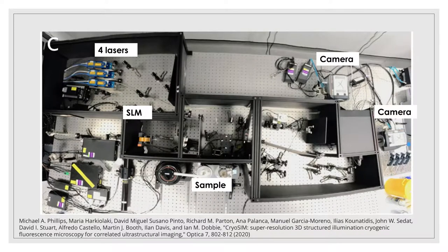This is the layout of the cryoSIM microscope from above. The lasers are combined into one path using mirrors and dichroics, and then pass through a neutral density filter to attenuate their intensity, and through a periscope to shift the beam height up. They then go through a square aperture to limit the light to the active area of the spatial light modulator. The SLM diffracts the beam to create the structured light patterns. The light reflected from the SLM passes through an iris to remove high diffraction orders, and the polarisation is rotated. Then the light is focused by some more lenses, and reflected onto a dichroic mirror, and eventually into the objective lens. From here, it shines on the sample, which is inside a cryo stage. The emitted fluorescence light is reflected through the dichroic mirror, and split in two, and is then detected by two different cameras.